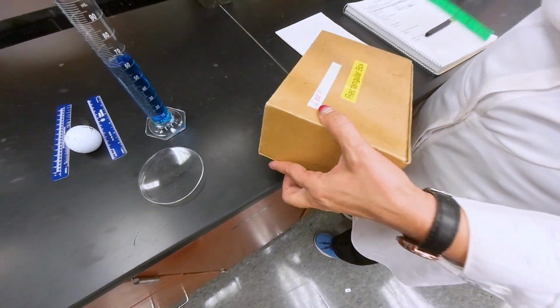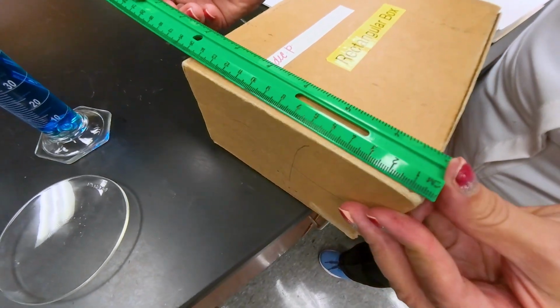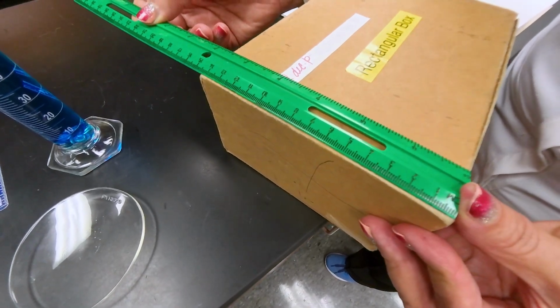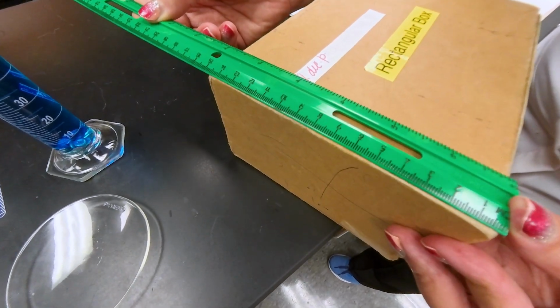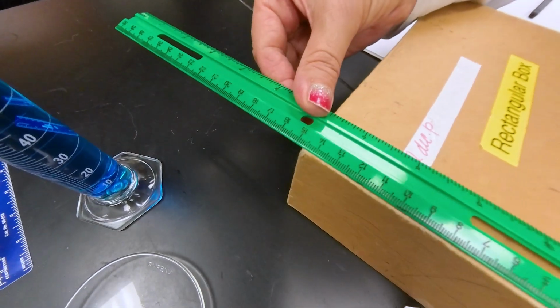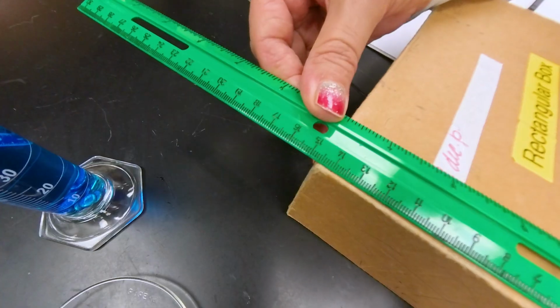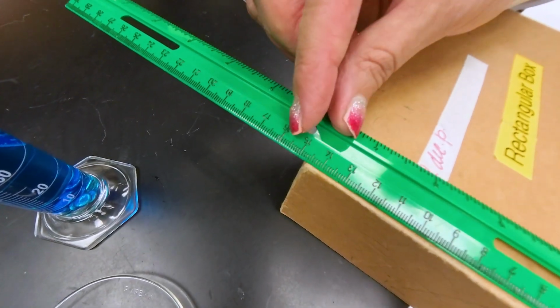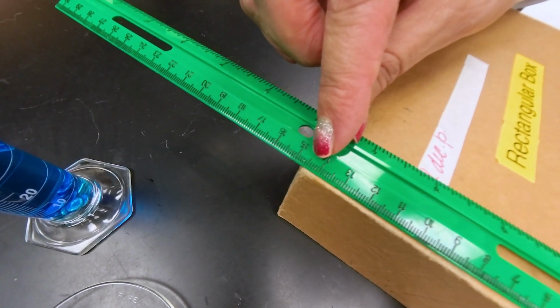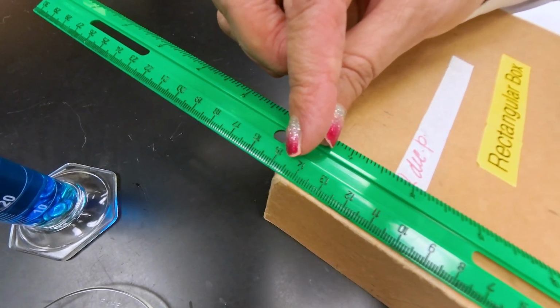Then you measure the width the same way, from 0 you go to see what number it aligns with, and this is what's important for us: the edge aligns to what number exactly. So it's between 14.5 and 14.6. You estimate the last digit.